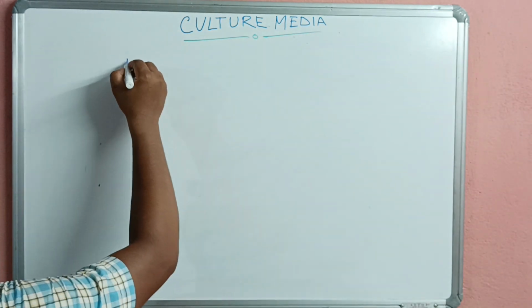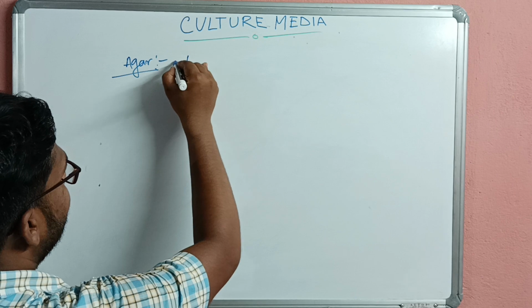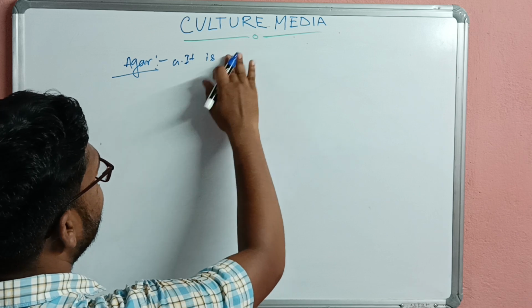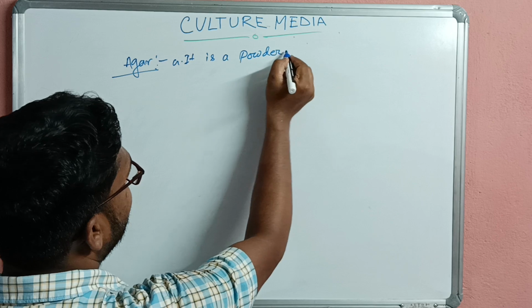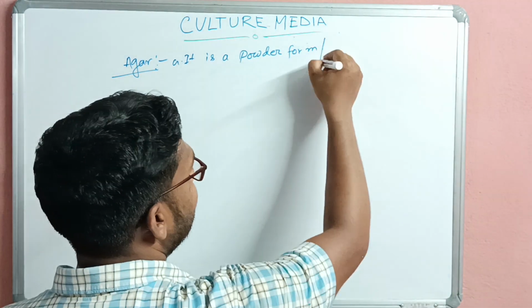What is agar? Number A, it is in powder form, dust form.